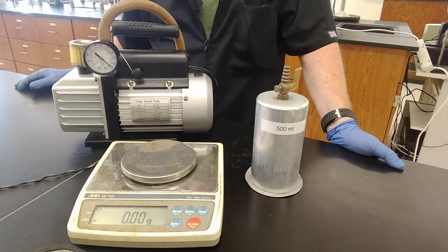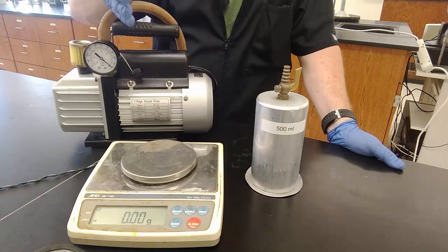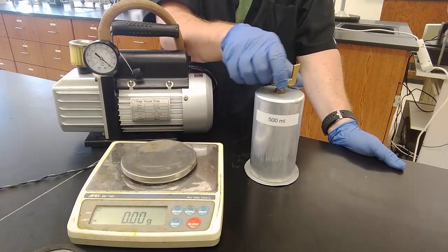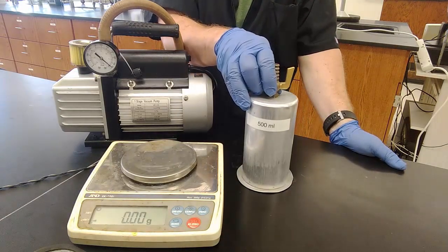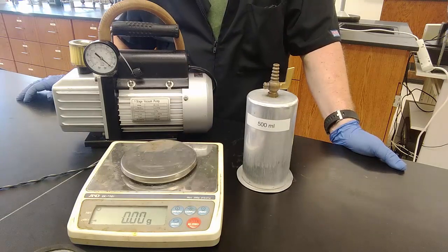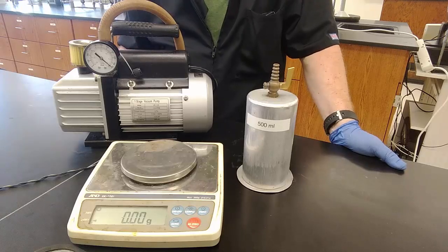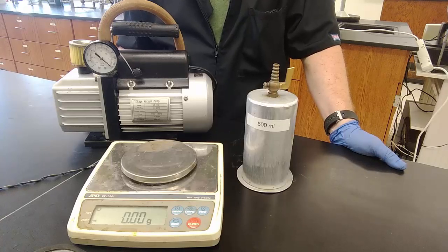Well, what could make that mass be too big or too small? In every single lab that we do this semester, that's the kind of thinking that you have to undertake. What could go wrong in this lab? Well, we're finding a mass and we're finding a volume. Well, volume is volume, at least in part 3 here. It can't be wrong. I mean, I guess if this densitometer was seriously dented somehow, that might mess things up, and then the volume could be wrong. But it's not dented. The volume is the volume. So then the mass is the only thing that could be off or wrong. Well, what could make that mass be off or wrong? Got to think about those things for your discussion of your lab report.